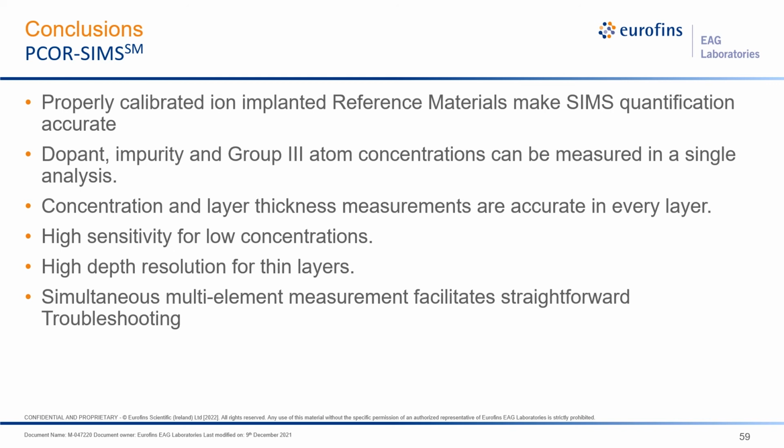You have to have very high sensitivity for low concentrations, especially in gallium nitride materials, and that requires special SIMS protocols. Now, unfortunately, we don't have a silver bullet in SIMS method that gives you everything you see here in one measurement. You have to have a very specific designed SIMS measurement to be able to address all the questions you will have.